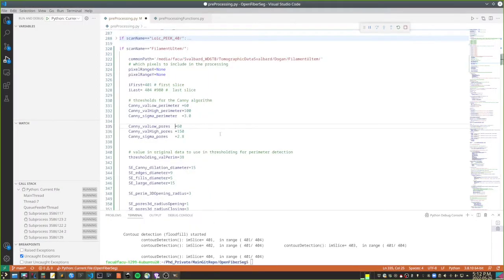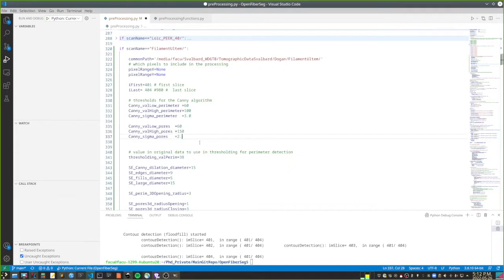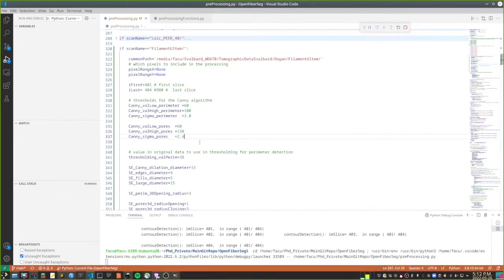But like I said, it might still work if the filling works correctly.